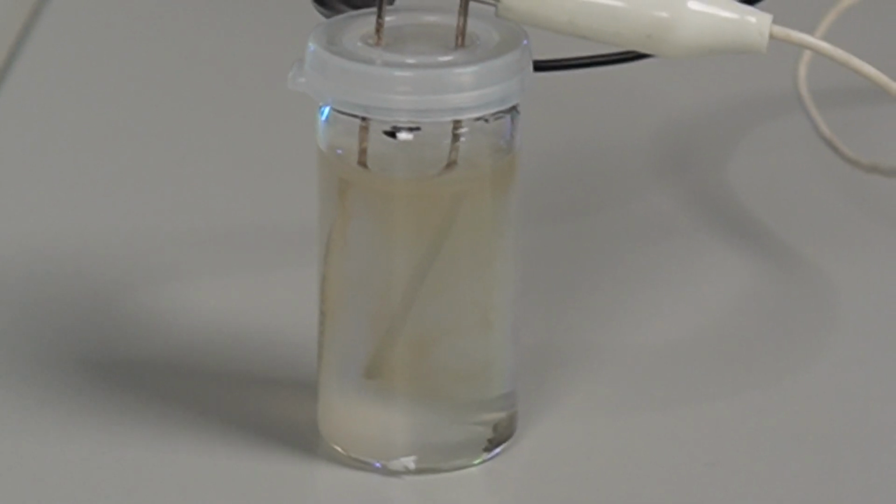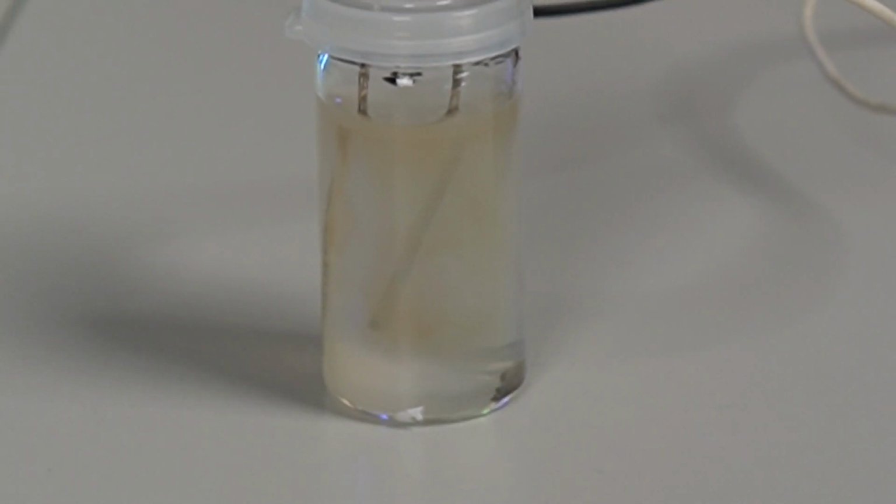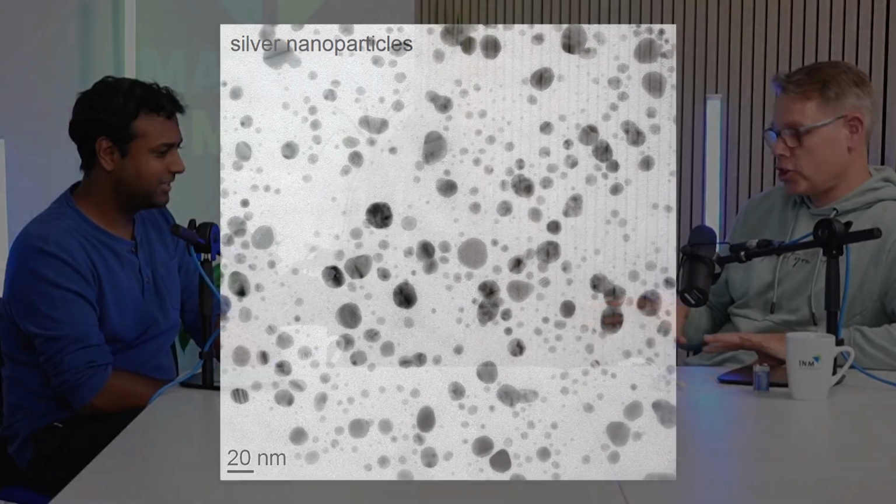With this easy setup, I cannot say the particles are all 5 nanometers or 10 or 15 nanometers. They are somehow size distributed. So these are silver nanoparticles coming off the electrodes into the water, just because of the voltage you've applied. There's a lot of science behind how you can change the setup, different current, different additives, and you will see it becomes more and more dark brownish. While creating these silver nanoparticles, they also grow and agglomerate. The challenge is then, can we somehow separate them by size?